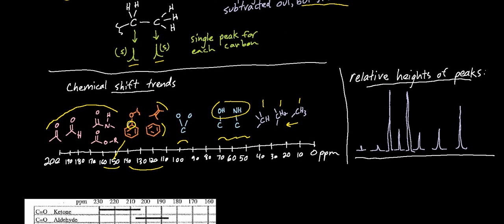If you have amides, esters, carboxylic acids, the distribution of electrons is among the 3 atoms here, for example. That has a little bit of a shielding effect compared to aldehydes and ketone carbonyls. Ketones are very de-shielded. So this region of the spectrum is especially useful.